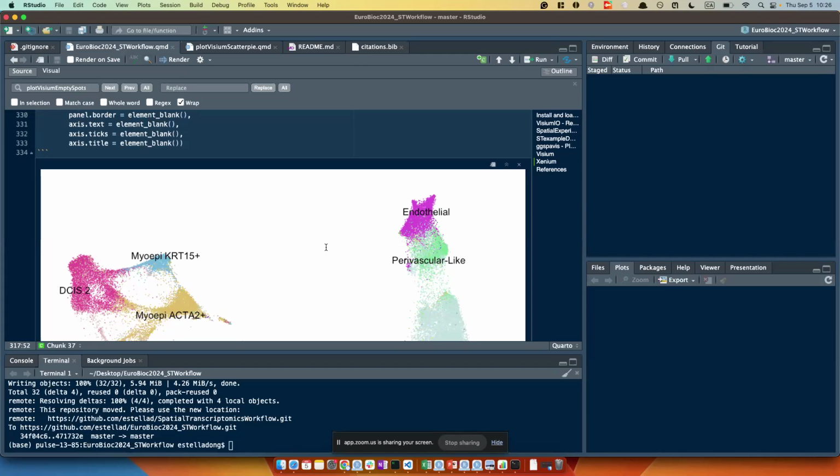Which one? SpatialExperiment. It's in the submission process. I think my contribution ID is 3370, so you can check that.